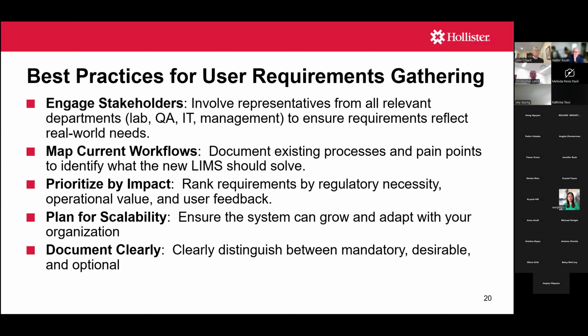Very important is your documentation when you are gathering and defining your user requirements. Again, you want to really distinguish between your must-haves, showstoppers, versus desirable, and then finally optional user requirements.